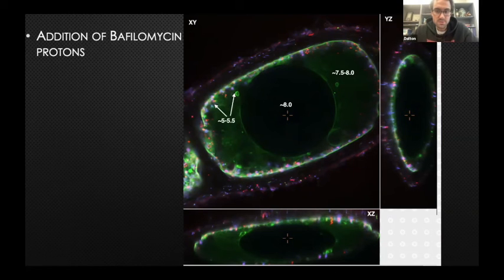So while the vacuole is not acidic, nor the cytoplasm, it seems that some of these free living endobionts are still acidic. So maybe they are still doing some sulfur oxidation there, and V-ATPases are inhibited here, which is preventing proton pumping into the central vacuole.